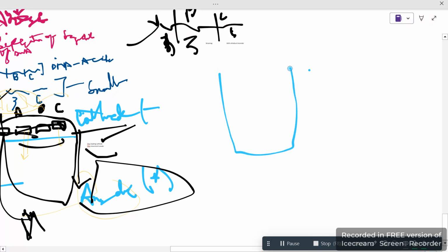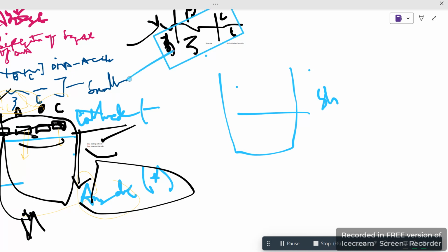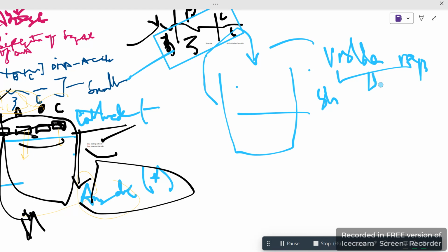This is the structure. Then we just start a staining process. You just added all these gel, these all substances into this, but still you cannot see the DNA strand. We are doing this staining process for the DNA because DNA is very small, so we want to see that. But still I've just placed it in staining, you cannot see, why? Just because there's a problem, and the problem is we are placing that in the visible rays, whereas you are supposed to change that into UV rays.